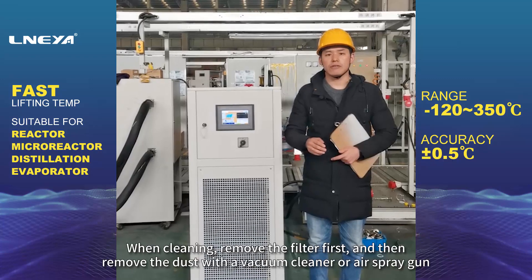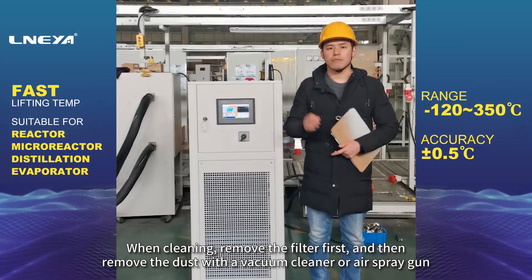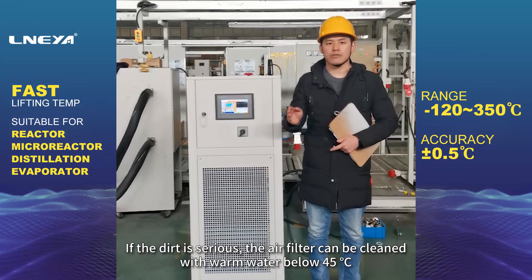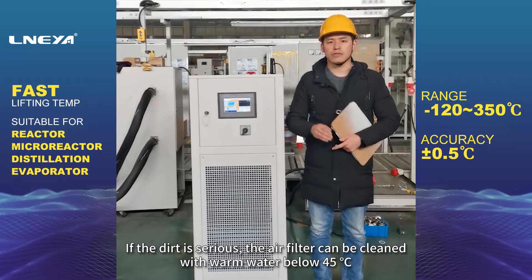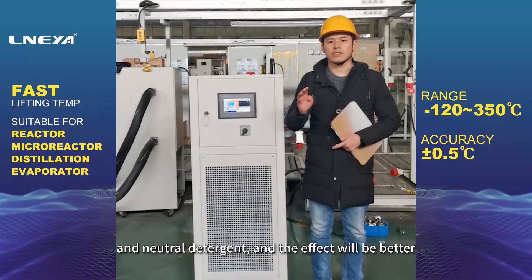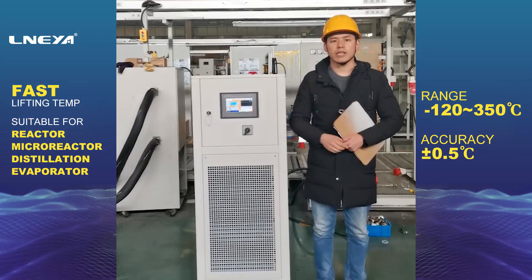When cleaning the air filter, remove the filter first and then remove the dust with a vacuum cleaner or air spray gun. If the dirt is serious, the air filter can be cleaned with warm water below 45 degrees Celsius and neutral detergent for better effect.